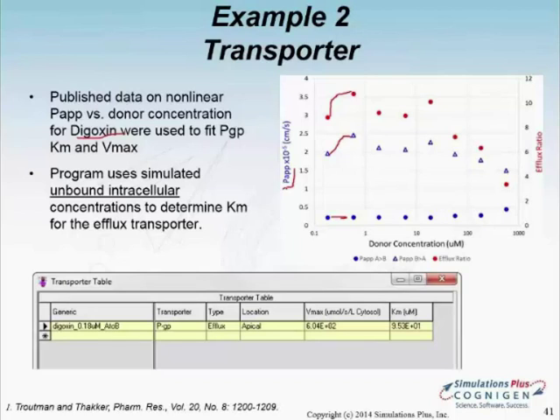At the moment we assume that the partitioning into the membranes would be the more dominant process, so the sequestration in the membranes would be the more dominant process. One of the aspects is how to account for possible non-specific binding inside the cells. We are still exploring that, and if that turns out to be a really dominant or important aspect, we would be adding that in the future.